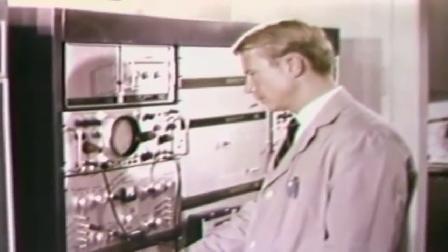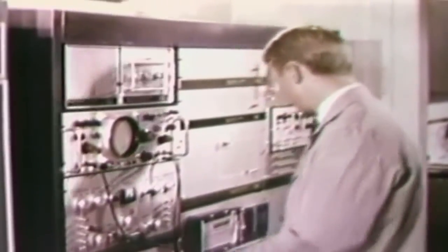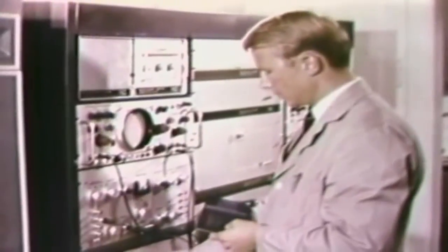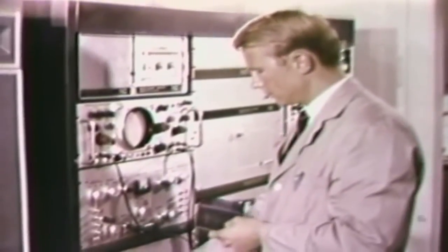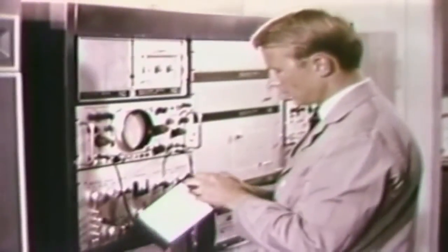The microscopic particles from the paraffin cast contain both antimony and barium as major constituents. These elements are characteristic of residues from primer discharges and indicate the subject could have fired a gun shortly before the paraffin cast was taken. Data relating to the analysis are preserved in graphical and numerical form for possible testimony in court.